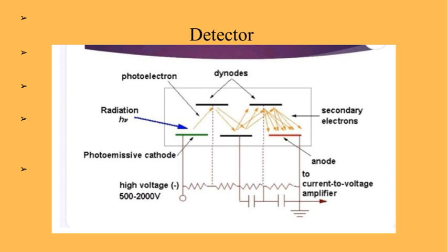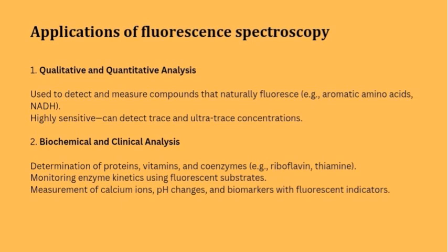Then, we have the accuracy of the detector, which directly impacts the reliability of our entire process. It's designed to distinguish true signals from noise, which is vital for making correct decisions downstream. Lastly, the detector's integration with the rest of the system ensures smooth operation, allowing us to process data efficiently and effectively. Overall, a well-designed detector is fundamental to the success of our system, tying together accuracy, sensitivity, and reliability to support our larger goals. This slide doesn't contain enough information. That's why we're moving to the next slide.